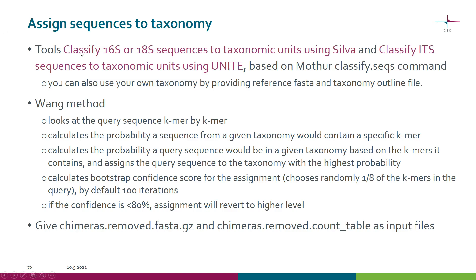There are two tools in Chipster for this. One of them classifies 16S or 18S sequences to taxonomic units using the SILVA reference database, and the other one classifies ITS sequences using the UNITE database.